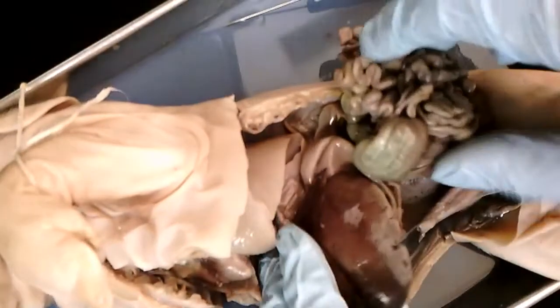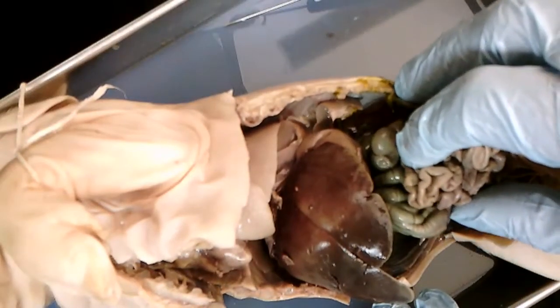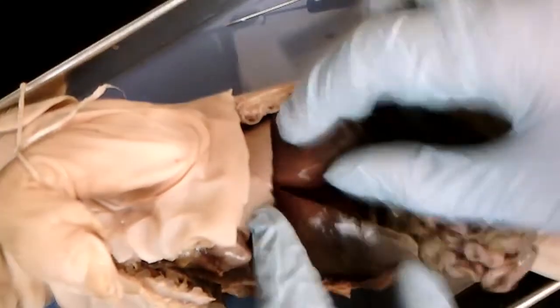Let's see. So the pancreas. So at the base of the stomach is where the pancreas is. Let's see if we can find that.